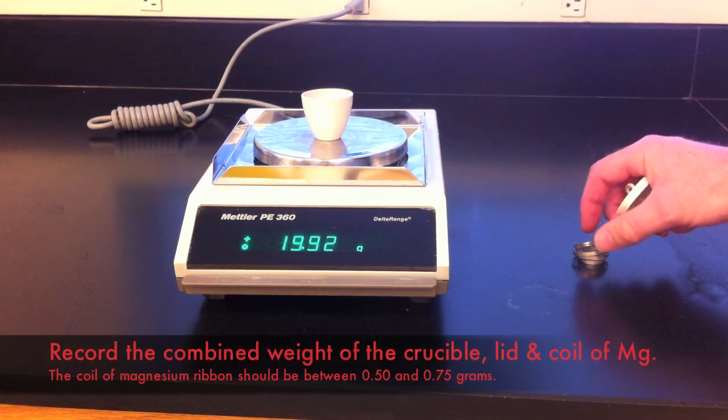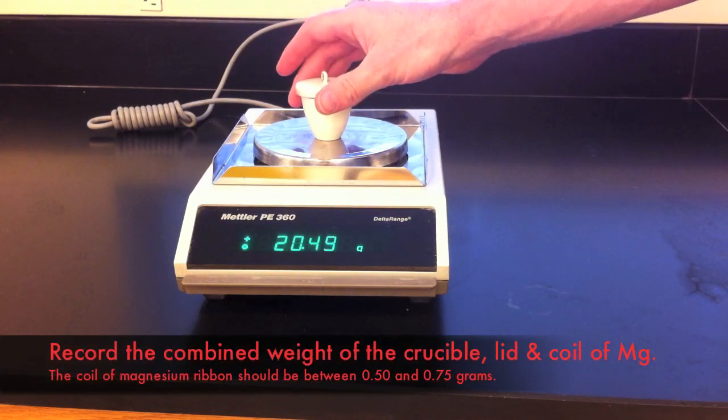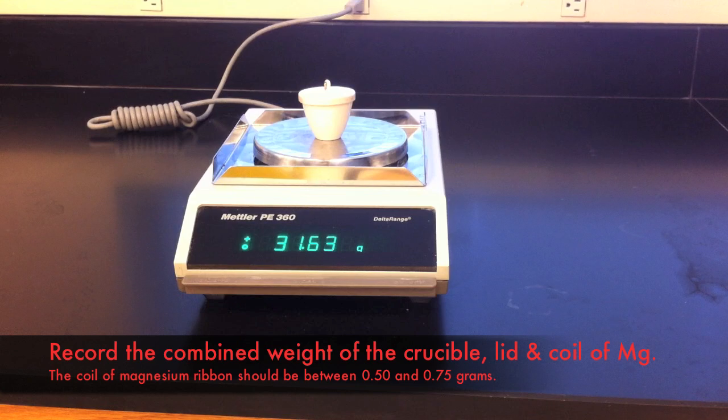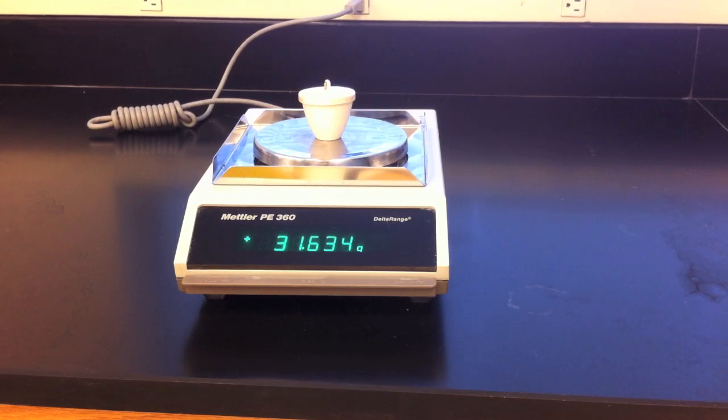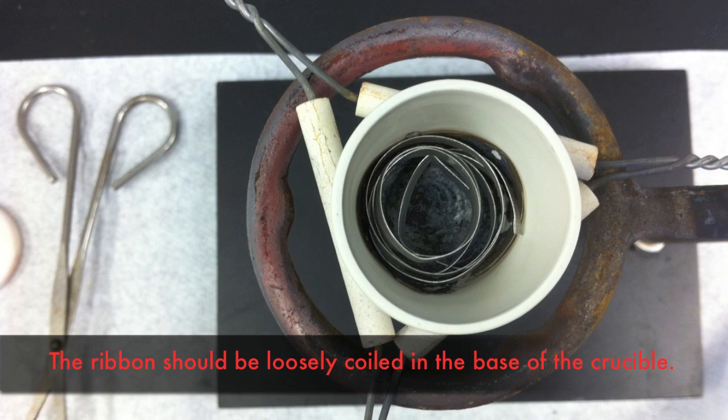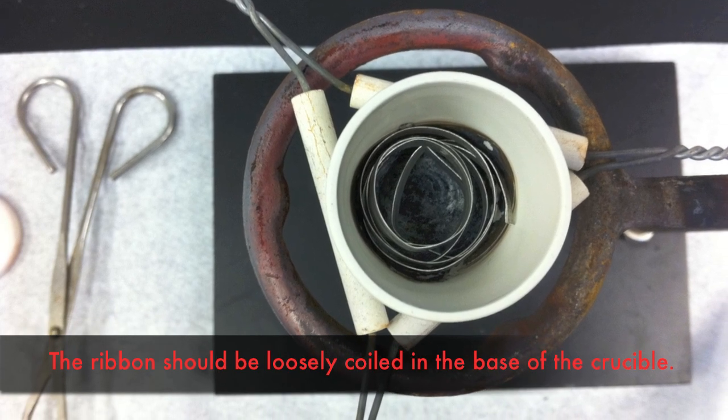Once you have recorded the weight of the crucible and the lid, add in the magnesium ribbon and record the combined weight. The weight of the ribbon should be about 0.5 to 0.75 grams. Do not wrap the magnesium ribbon too tightly. Air needs to get in for the reaction to take place.